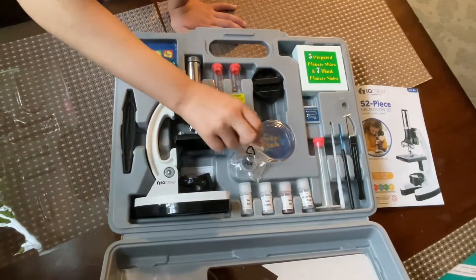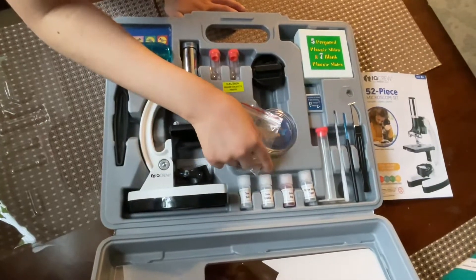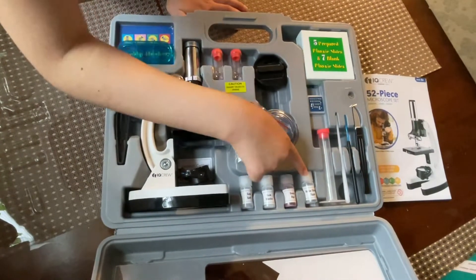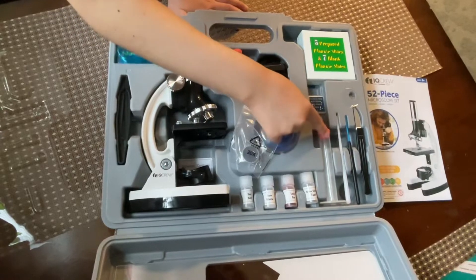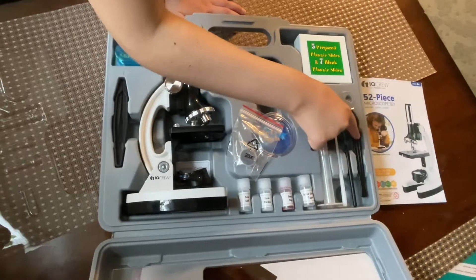This is the sample dish. There are some sea salt, gum media, something dye, and brine shrimp eggs. And here are the graduated cylinder, stern rod, needle, and blade.